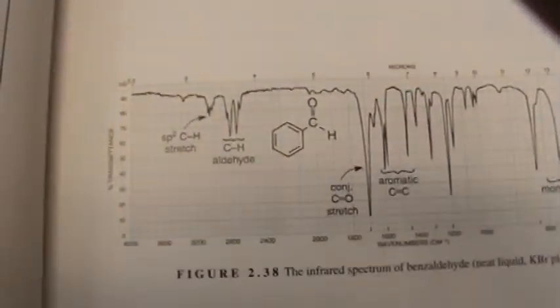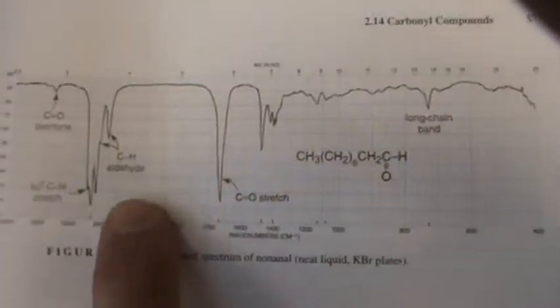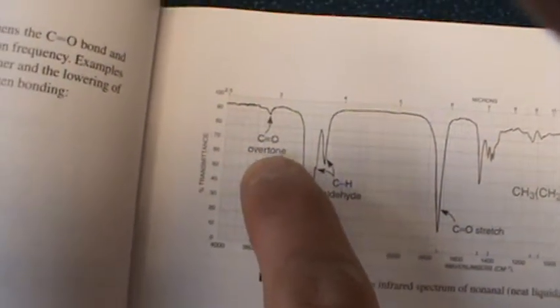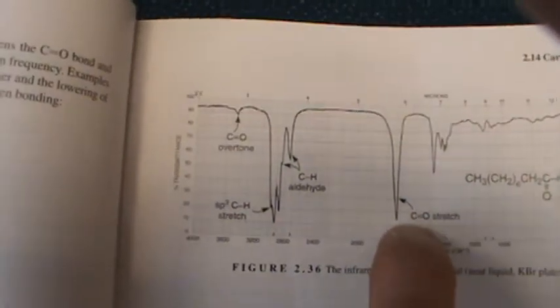And if we go down and look here, you have no sp3 carbons. So obviously these 2 peaks are very isolated and easy to see. Something tells me that our product is going to look a lot like this, where you may or may not see the one, right? The other one could be buried. They often talk about a CO overtone. When you see a little spike, that is the overtone of the CO stretch.